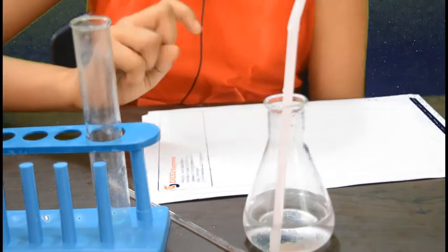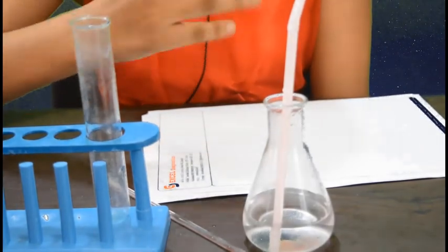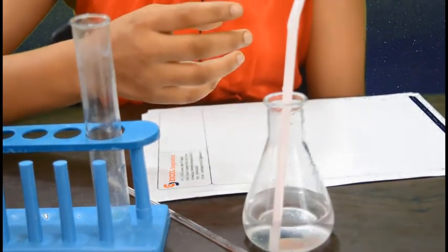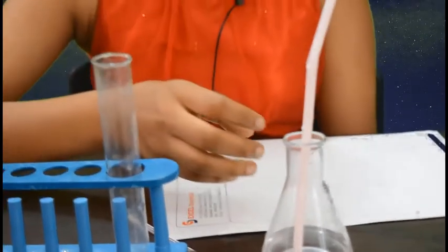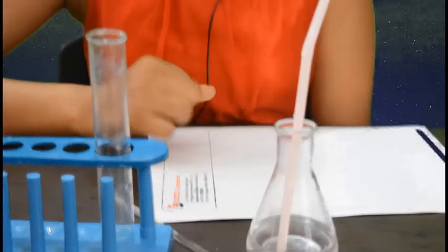The solution turns colorless. This is because when we breathe out we release carbon dioxide. Carbon dioxide reacts with water to form carbonic acid. Carbonic acid is acidic in nature. When phenophthalein mixes with acidic solution it forms a colorless solution.